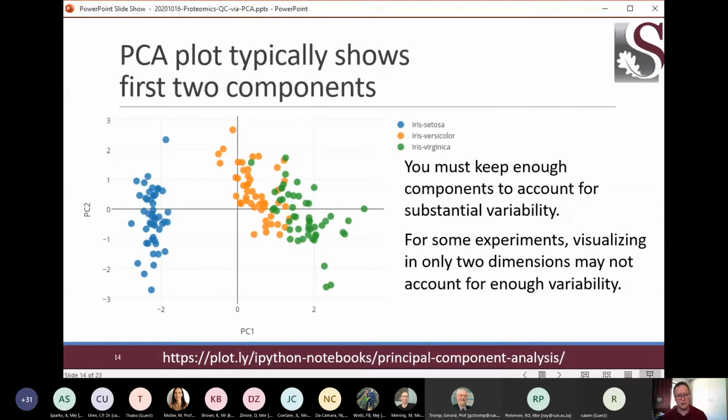Now, this is a really widespread data set that you frequently see used in data science classes. Here, each dot represents a particular flower, and we're looking at sepal length and width and petal length and width, so each of these points has a four-value address in 4-dimensional space. Did I just talk about 4 dimensions? I did, because the more metrics you have, the more dimensions this PCA is going to be working with.